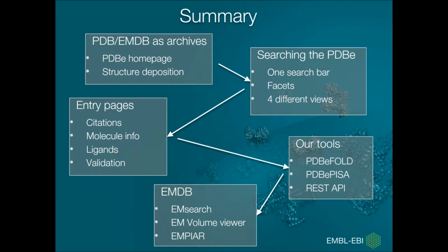I'll also tell you about the Electron Microscopy Data Bank, how you would search this database for electron microscopy volume data, different ways you can view the data using our volume viewer and image viewers, and finally EMPIAR, which is the Electron Microscopy Pilot Image Archive, and I'll introduce that.